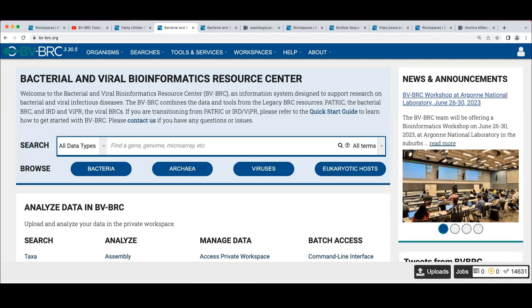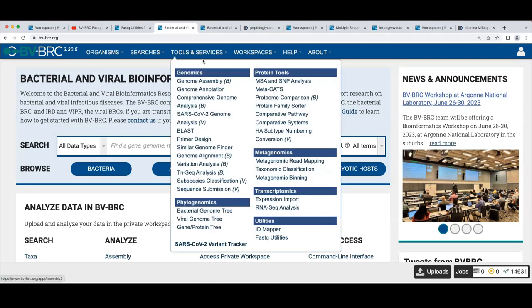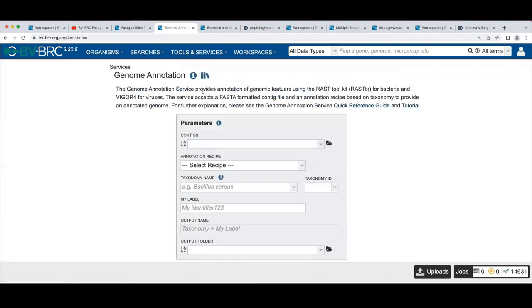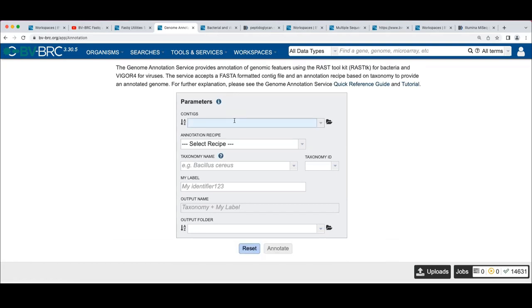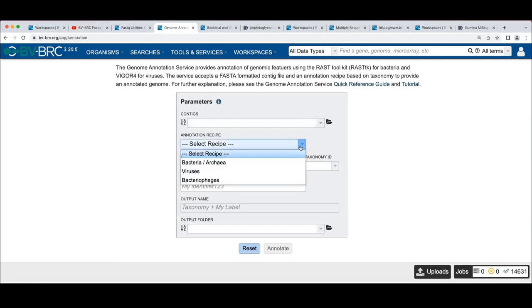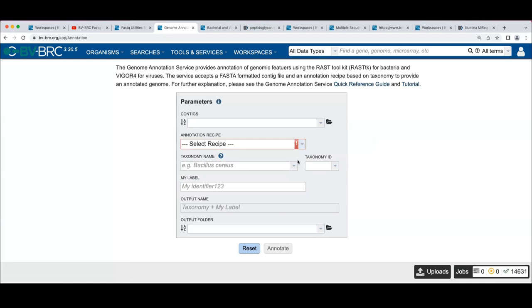The genome annotation service looks similar, except it's designed to start from contigs rather than reads — so you need an assembled genome to use it on its own. The comprehensive genome analysis service can take either reads or contigs. We have a bacterial, viral, and bacteriophage recipe for annotation, which largely determines the database of curated proteins used for lookup.